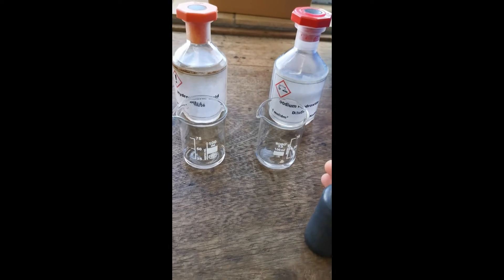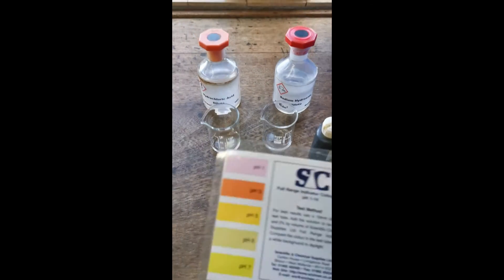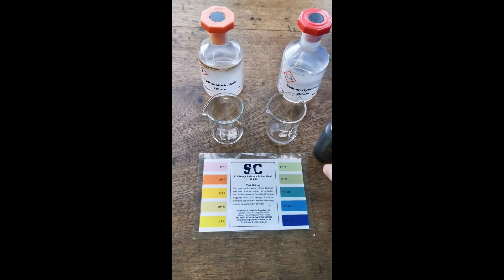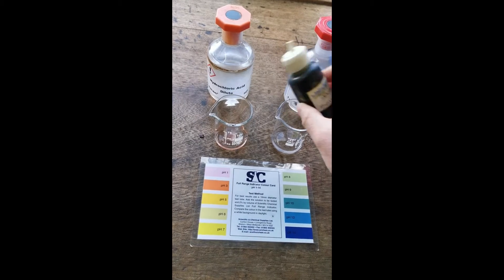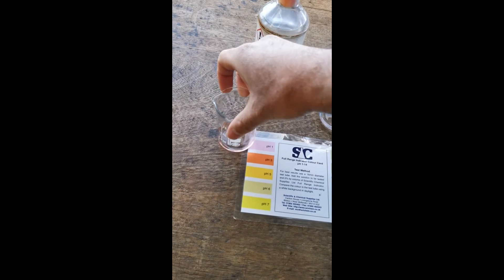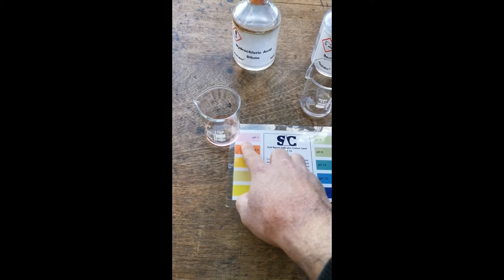We can then add a few drops of universal indicator solution and compare the colours to this chart. First we'll add a few drops to the acid, and you can see that it goes red. We can confirm that it has a pH of 1.